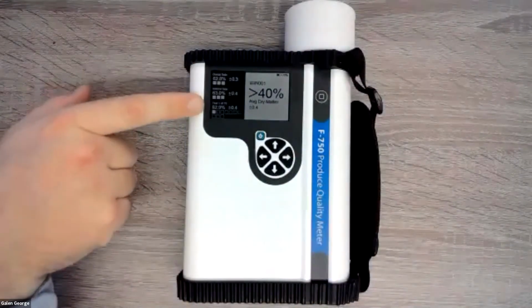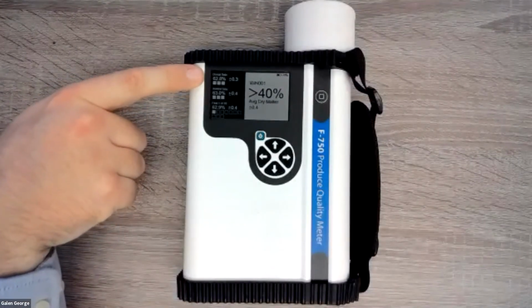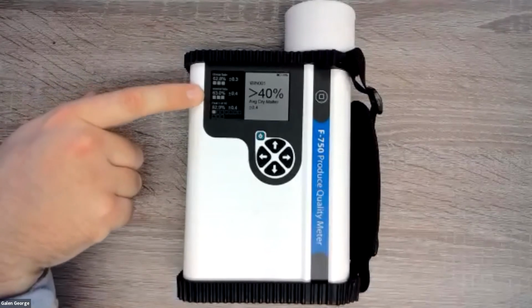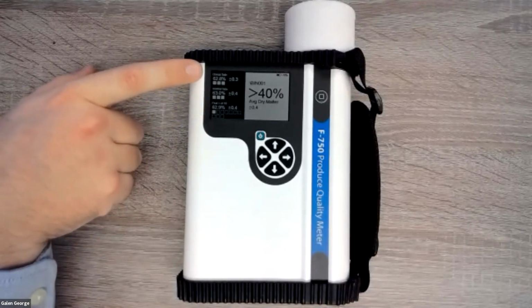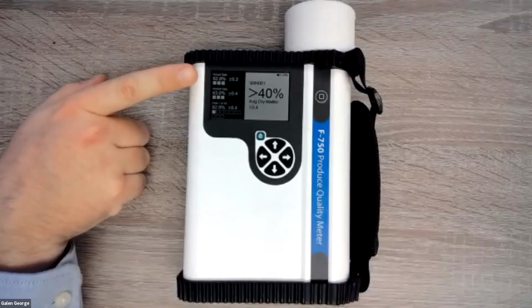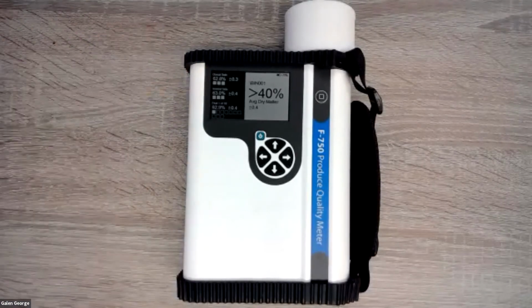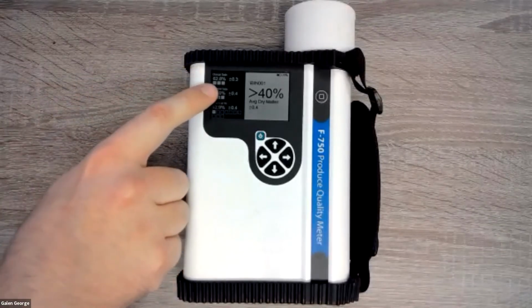All the smaller data on the left-hand side represents different sides of the fruit, and also the average of the singular fruit. So what these boxes represent, this top measurement here, for instance, is the dorsal side of the avocado. If I scanned the dorsal side of the avocado, it would give me this average of 3 measurements.